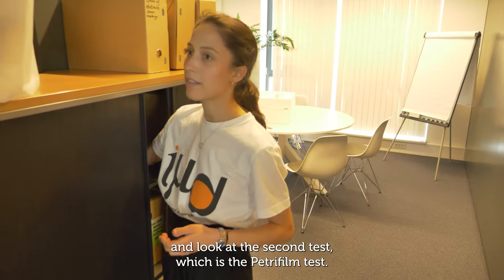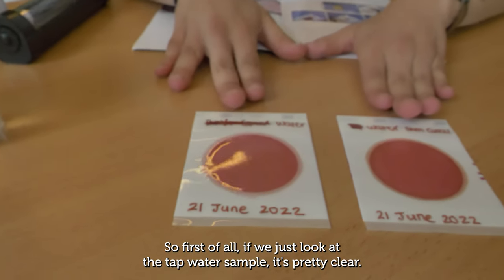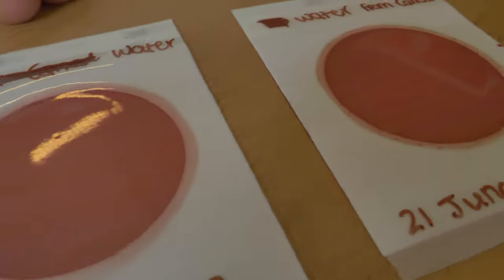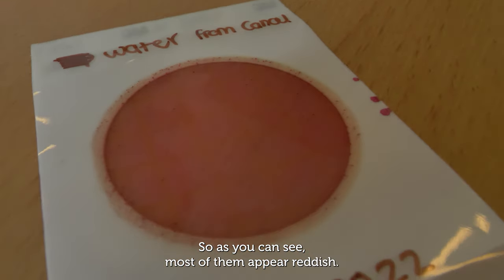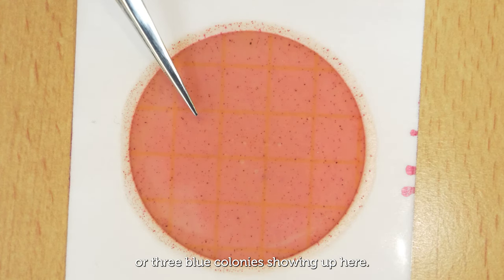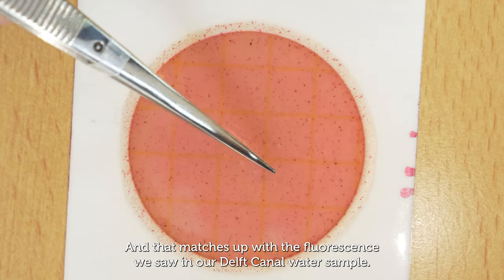Now let's look at the second test: the Petrifilm test. We've prepared two Petrifilms. If we look at the tap water sample, it's pretty clear — no bacteria growing. But in the canal water sample, there are definitely colonies growing. Most appear reddish, so those are non-E. coli colonies, but there are maybe two or three blue colonies showing up.